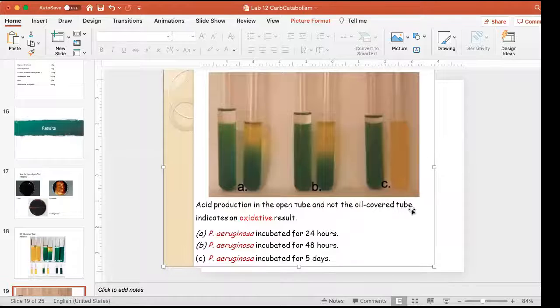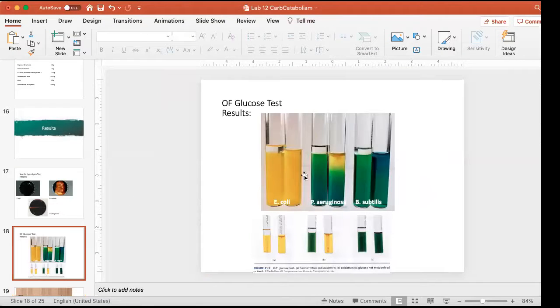It's just a feature of that organism that when it's in OF, it grows very slowly. Obviously it doesn't love OF medium. It doesn't have everything it needs to grow fast in OF. So 3 different organisms, 3 very different OF tests.